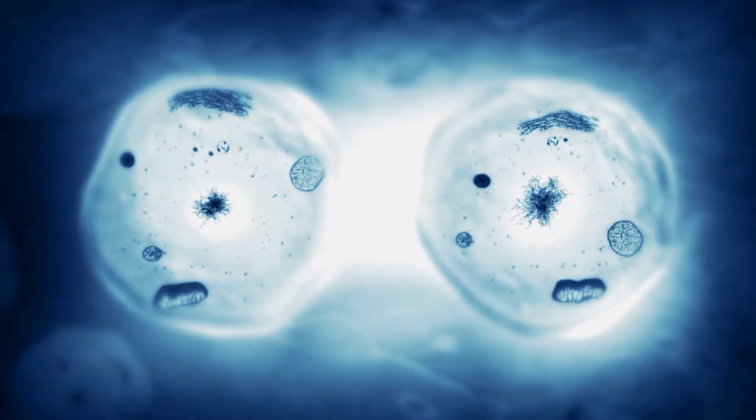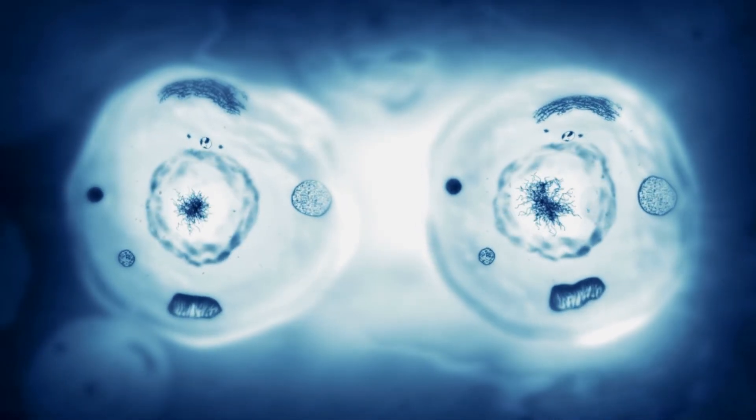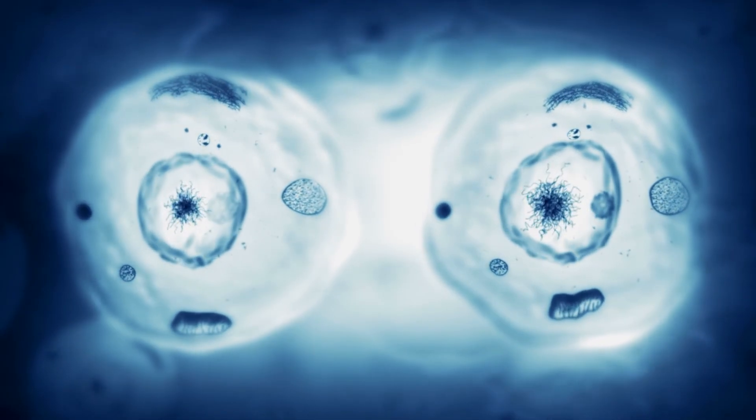After the two daughter cells have been formed, each cell enters interphase and prepares to continue the process of mitosis. Through the process of mitosis, an onion is able to grow and develop into a mature plant. The same process of mitosis enables our bodies to grow and develop into mature adults.